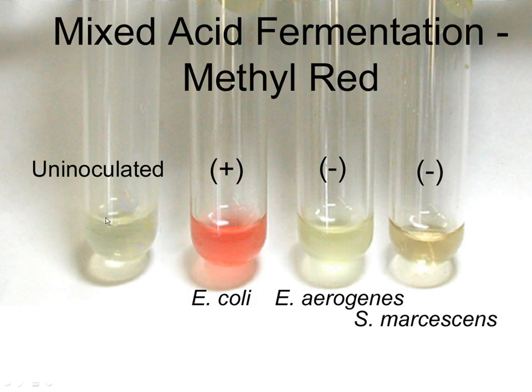So here's what the media looks like with nothing happening. Here's what the media looks like with E. coli, Enterobacter, and Serratia after the MR reagents have been added. Notice E. coli is the only one that is MR positive, shows the red color.